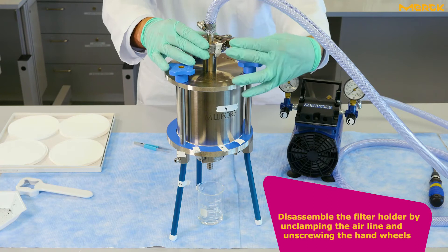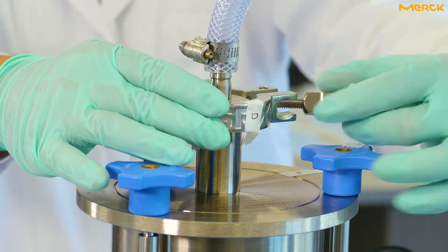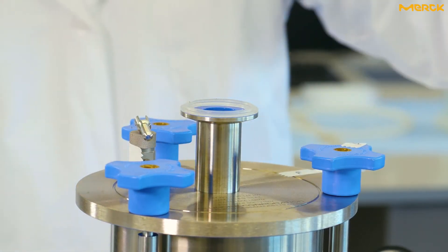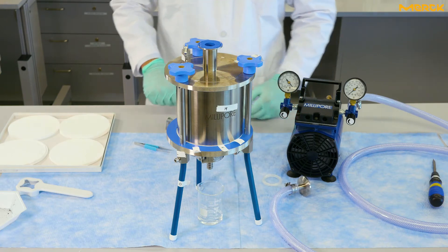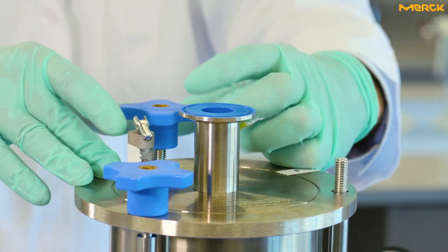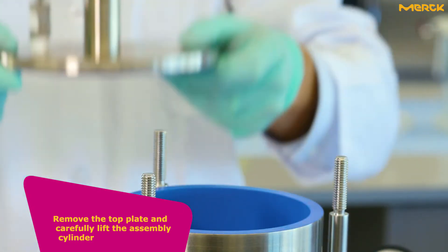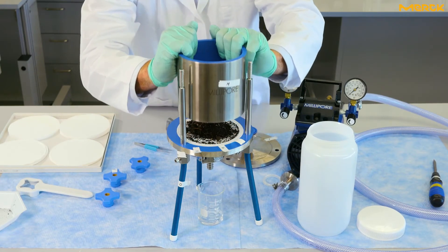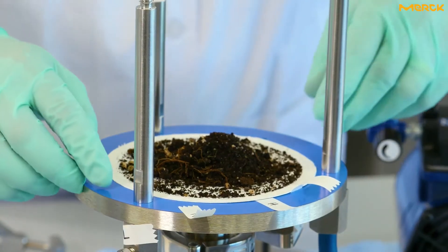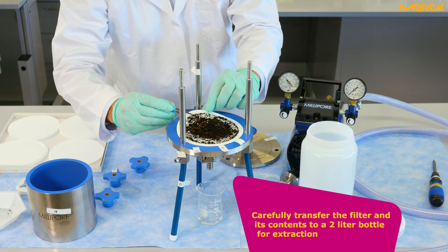Disassemble the filter holder by unclamping the airline and unscrewing the hand wheels. Remove the top plate and carefully lift the assembly cylinder. Carefully transfer the filter and its contents to a 2-liter bottle for extraction.